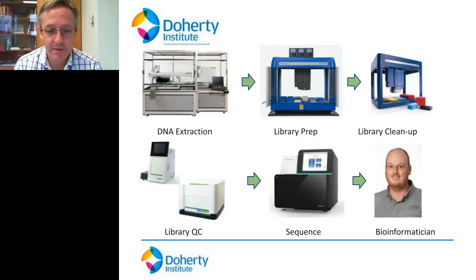And then the key thing here, which I've highlighted, is the need for bioinformatic support. This is Torsten, who's our main bioinformatician in our laboratory. But there's no doubt that you can't get the significant benefits of genomics without the high-level bioinformatic expertise that's required to extract the meaningful information from the data. So that's a key part of the setup.